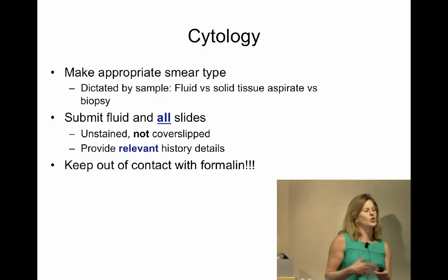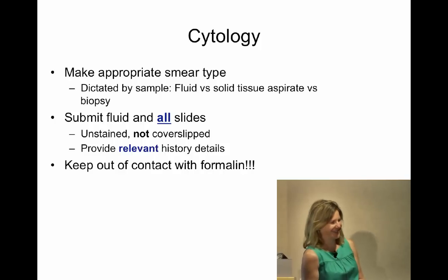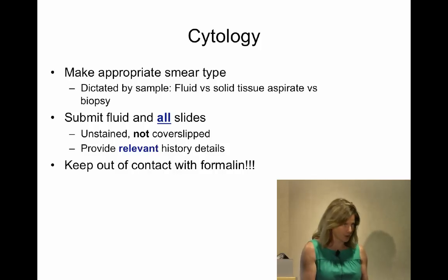Yes, we know you're going to keep a slide, and I encourage you guys to look at your own cytologies. But there's nothing that we hate more than Diff-quik. I hate to say that. But Diff-quik is really challenging. So send us everything you have, because you may think you've sent us the best slides, but you actually may have the only diagnostic slide in your hand. And then you've wasted, for us, maybe $40.